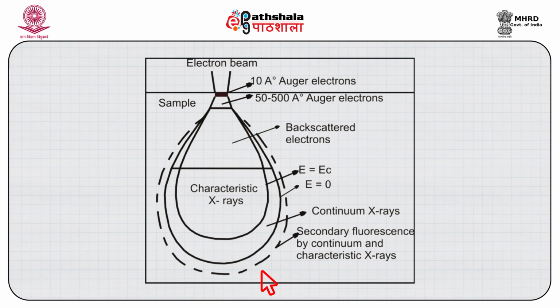One, the characteristic X-rays, which means that they refer to a particular energy level transition within a particular atom, and the other a continuum of X-rays which represents the background material, and we need to know both if we were to characterize the chemical heterogeneity in a material. The characteristic X-rays produce a very good effect to chemically quantify the nature of material.